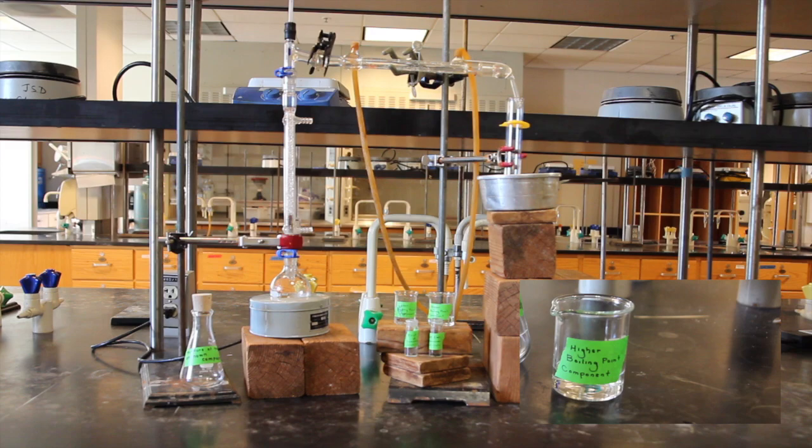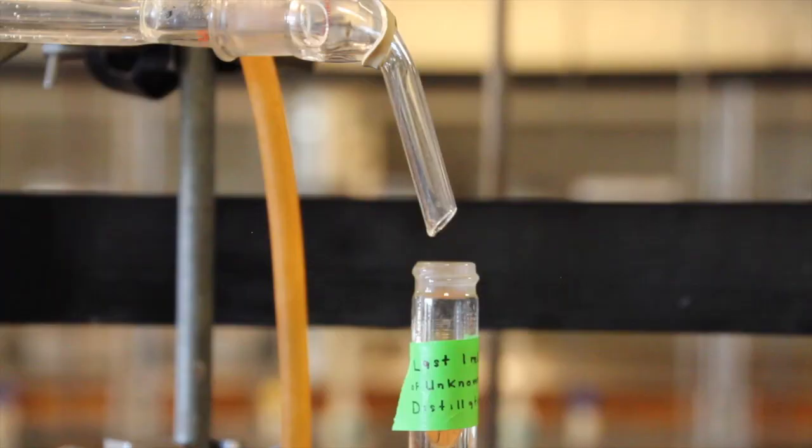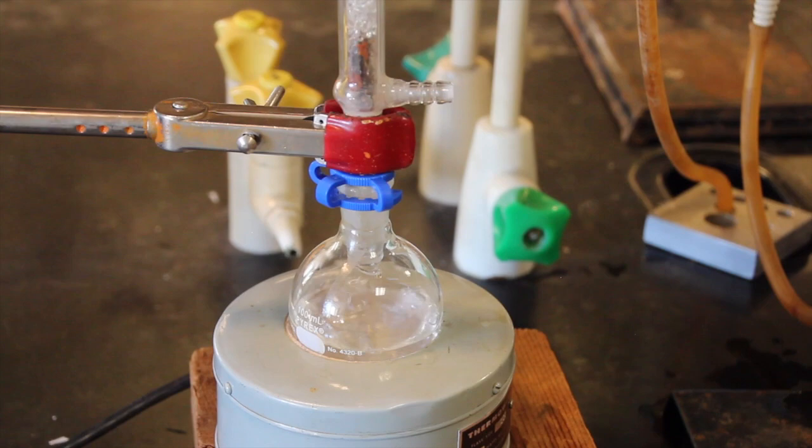Begin emptying the graduated cylinder into a second beaker or flask labeled for the higher boiling component and collect the second distillate until you near the last two milliliters. Collect the last milliliter separately in a labeled conical vial. It is important to always leave some liquid in the bottom of your apparatus and not boil until the round bottom is dry.